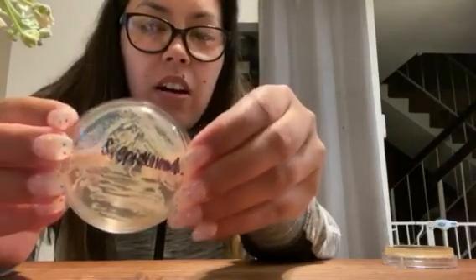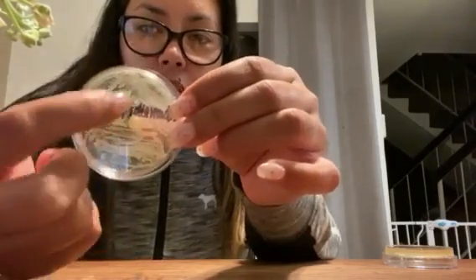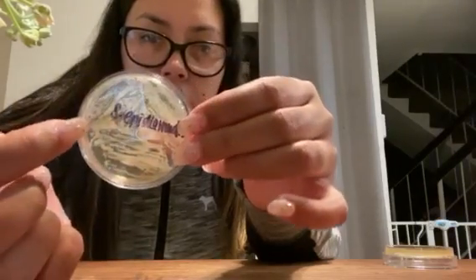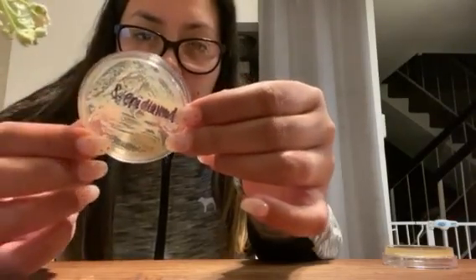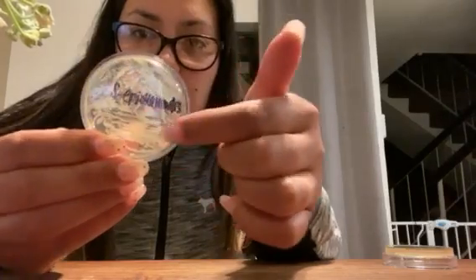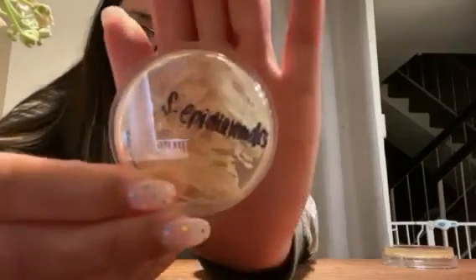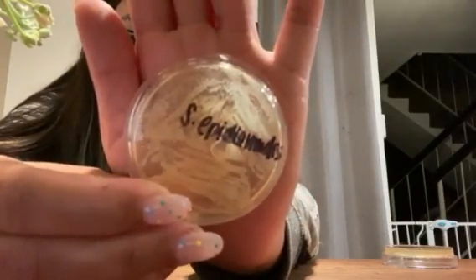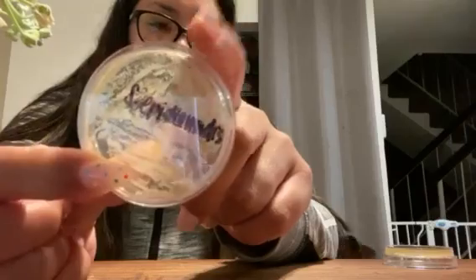The S. epidermidis shows a lot more streaking than the E. coli. You can see all four quadrants being streaked. You can see the lines of the streaking over on these three, and then it becomes speckled up at the top corners over here and more spread out. I'm not sure if that's from transferring the cultures from each quadrant, and if that's why that occurred, but you can see the speckles and then where I streaked it. So this epidermidis one had a lot more growth than the E. coli.